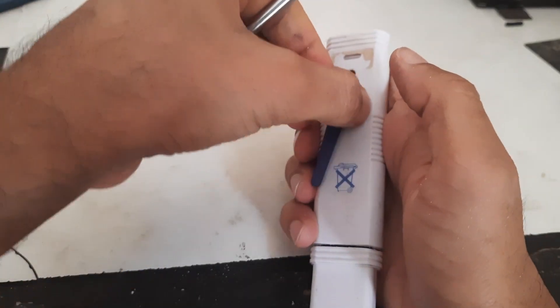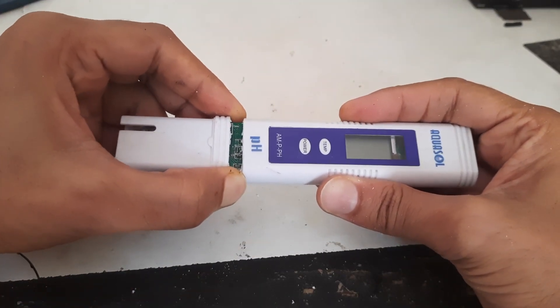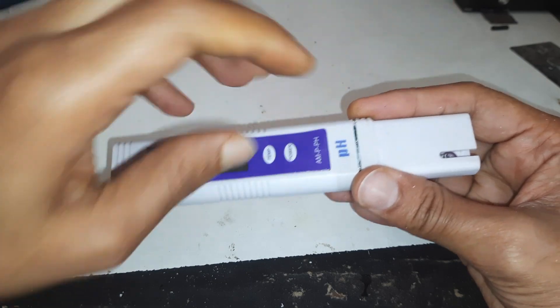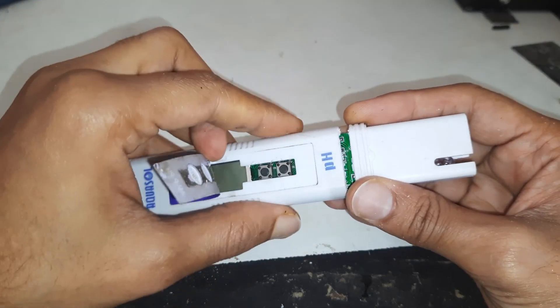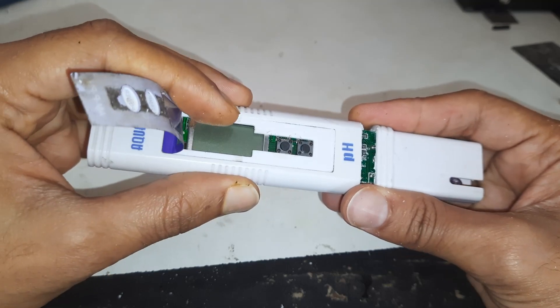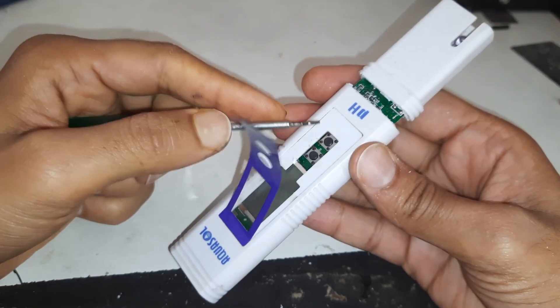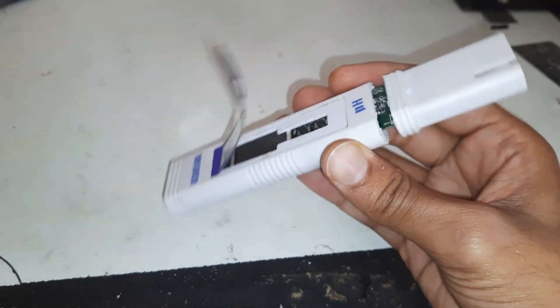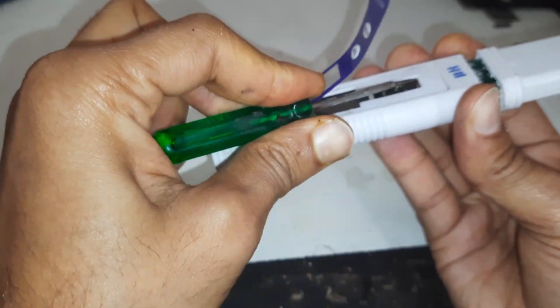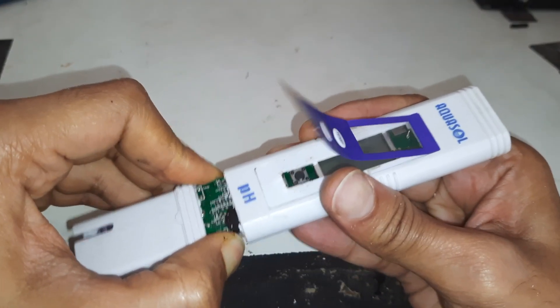Maybe this clip is creating trouble. Even after removing the clip it remains stuck. Maybe this switch is creating a problem. Yes, this is the real culprit — using a screwdriver it came out, and I did the same with the second switch.